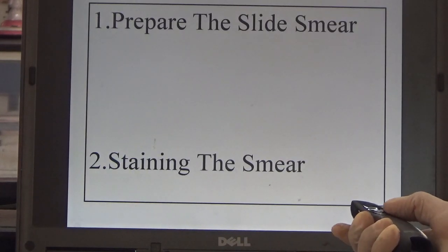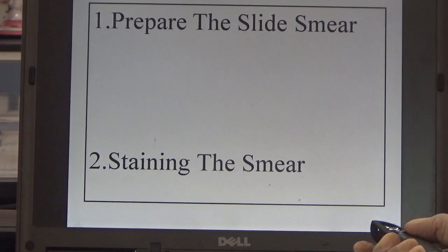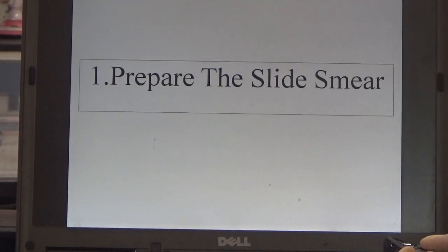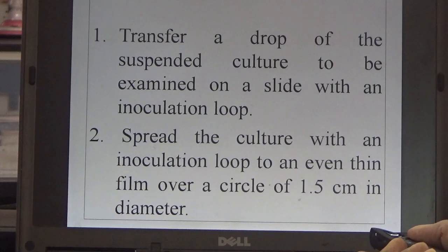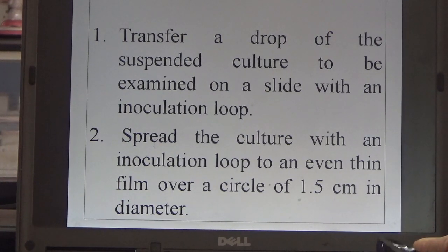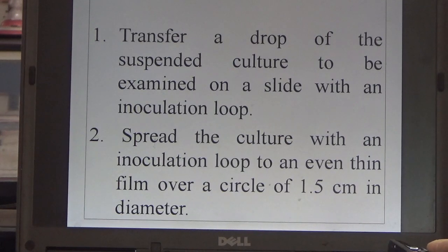Procedure. Step 1: Prepare the slide smear. Step 2: Staining the smear. Let's first prepare the slide smear. Transfer a drop of the suspended culture to be examined on a slide using an inoculation loop. Spread the culture with the loop into an even thin film over a circle of 1.5 cm in diameter.